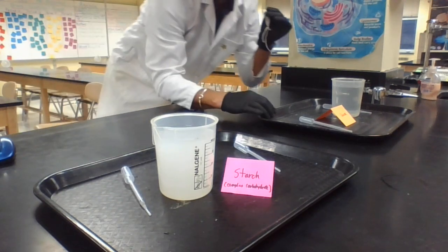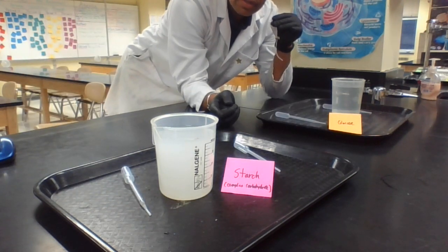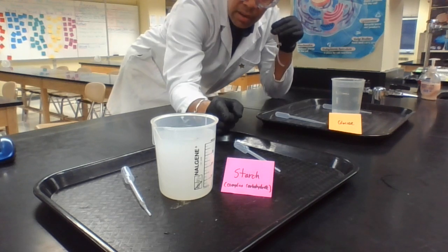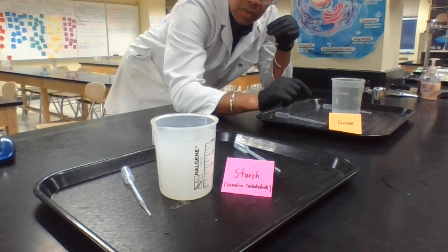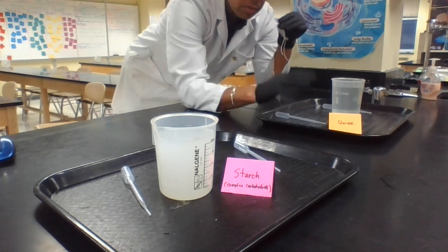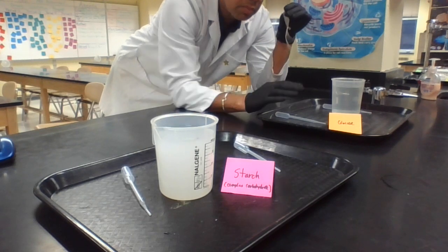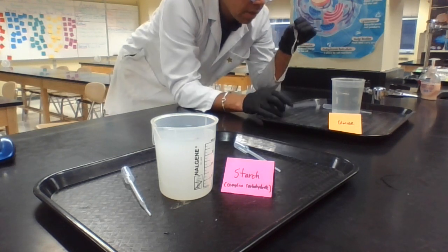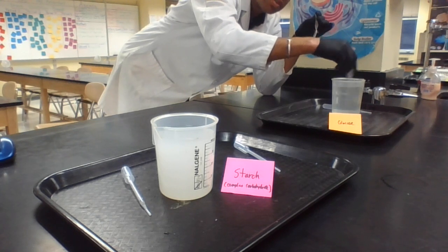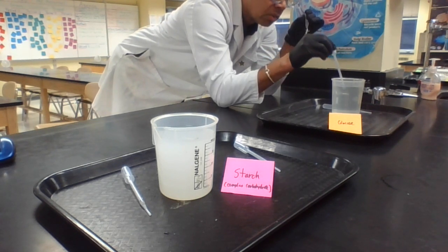Then I go over to the glucose. This is the sugar. Remember, this is what is found inside a starch. A bunch of these glucoses bond together. It can make our starch or our complex carbohydrates. So the starch would be the non-sweet carbohydrate. This would be the sweet carbohydrate. Okay. So this is a glucose solution. It just looks like clear water, but there's a lot of sugar that's been dissolved into it.